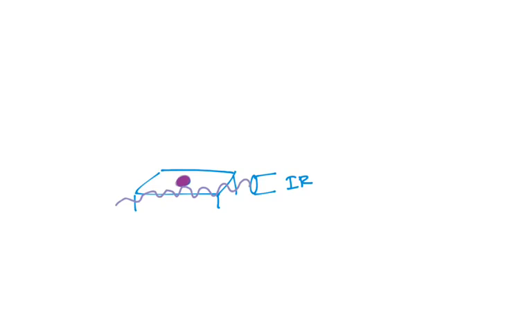dichloromethane. Dichloromethane is this, right? Two chlorines on methane. Dichloromethane does not have any alcohol group or ketone group, so it does not interfere with your sample. Right? Don't use acetone. Right? Acetone has a ketone functional group.